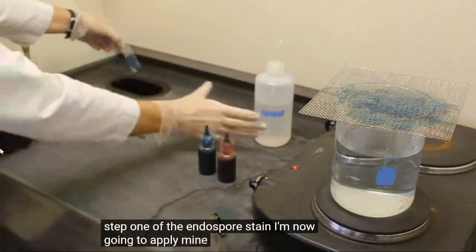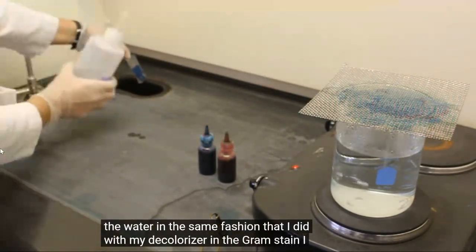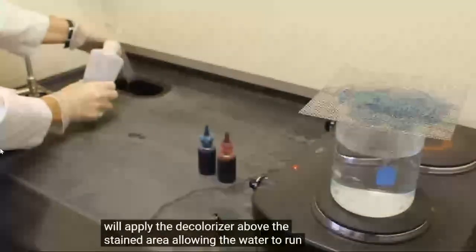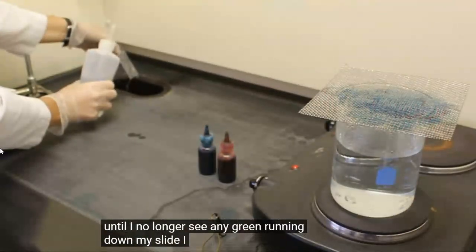I am now going to apply my step 2 decolorizer, the water, in the same fashion that I did with my decolorizer in the gram stain. I will apply the decolorizer above the stained area, allowing the water to run down the slide. I allow this to happen until I no longer see any green running down my slide.